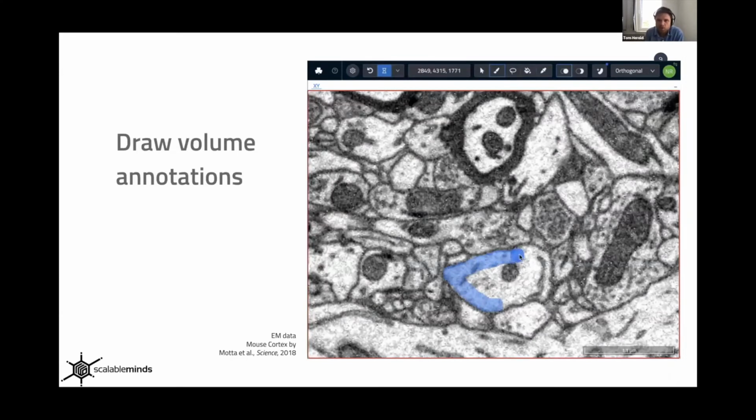On top of that, I mentioned that you can do annotations. So webKnossos can do several sorts of annotations. We have volume annotations, so you can just brush in individual objects, individual cells. We see that being used in some cases as the analysis itself. So if you only want to mark a few cells manually, that's fine. But in other scenarios, we use this for gathering training data to then train AI models, machine learning models for doing automated analyses.